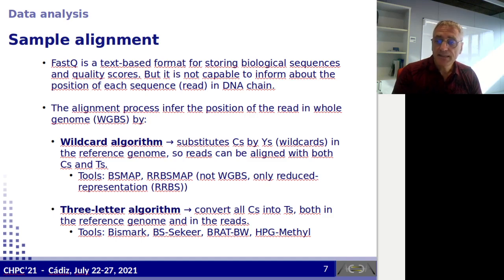The first step in the DNA methylation analysis of a biological sample consists of aligning each read and detecting its methylation status. By aligning and comparing bisulfite sequencing reads to the reference genomic DNA sequence, it is possible not only to align the read, but also to infer the DNA methylation pattern at base pair resolution. However, the data to be processed are huge, and a high computational power is required for an efficient operation. For example, the length of the DNA chain in the human genome is 3 billion nucleotides.